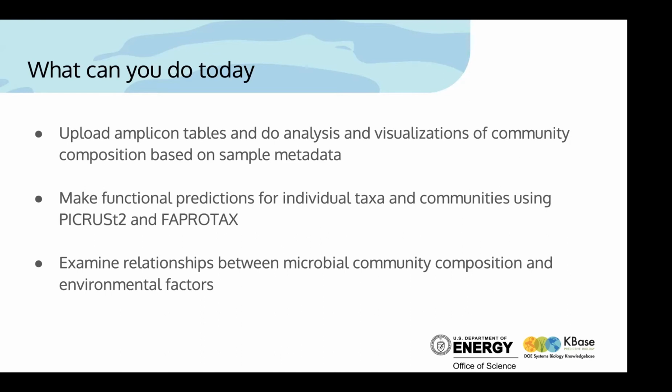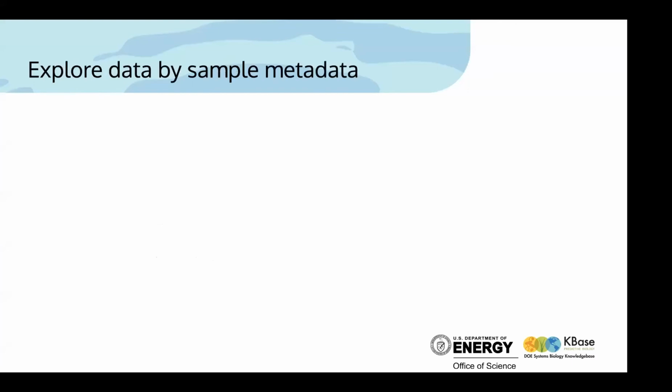And then we can also examine relationships between microbial community composition and environmental factors or other sample metadata that is contained within those templates. And we'll have additional webinars on each of these topics that walk you through the apps and how to use them and the specific details. So I'm really just giving an overview of what it looks like to do this.